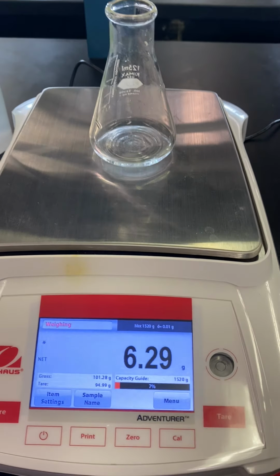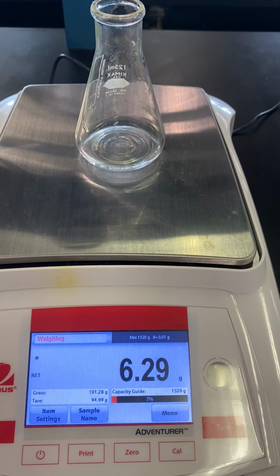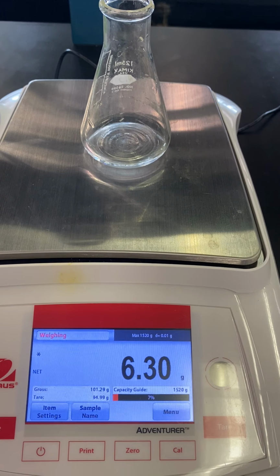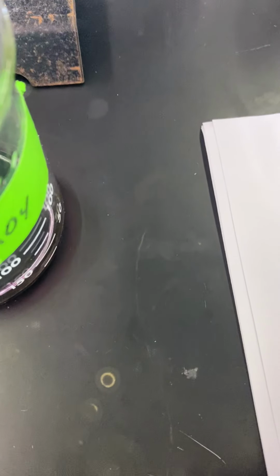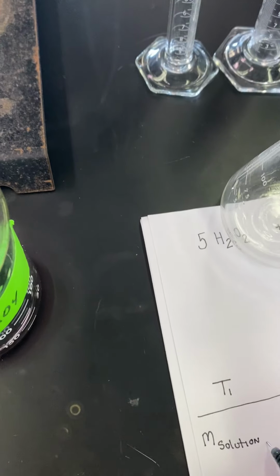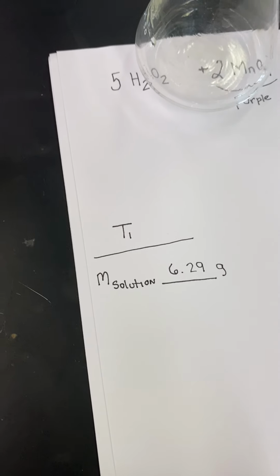So I overshot 6 grams a little bit, but that is absolutely fine. I'm not worried about that at all. It looks like it settled very well at 6.29 grams. And so that is what I'm going to record on my data sheet for trial 1. Okay. So trial 1, I'm going to do mass of my solution. 6.29 grams.